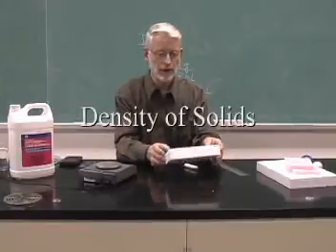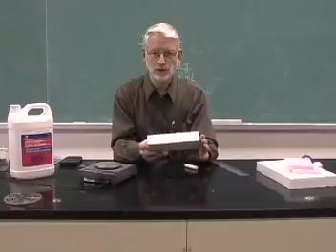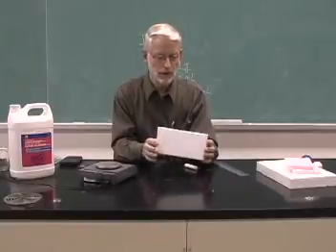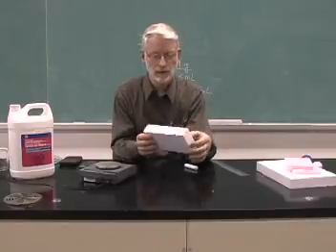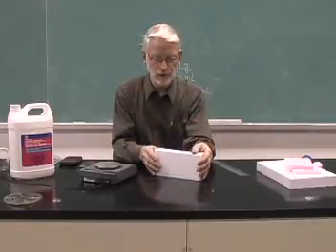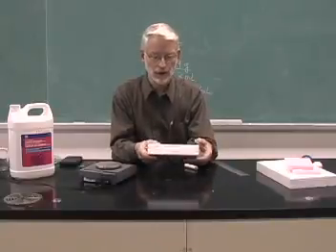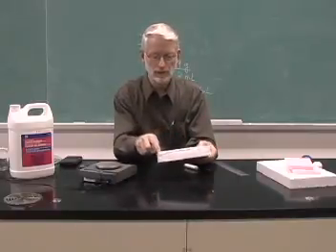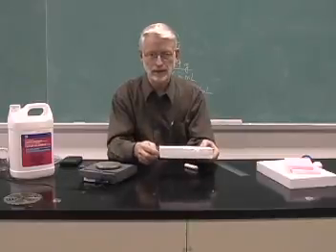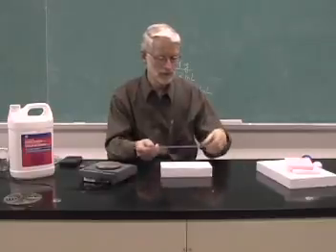We can also calculate the volume without actually measuring it using a graduated cylinder. Here we have a styrofoam block, and by this time students will likely have already calculated the volume of a rectangular solid. And we need for that the dimensions of length, width, and height. And so we can measure that using our ruler.